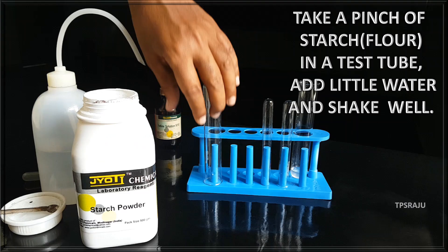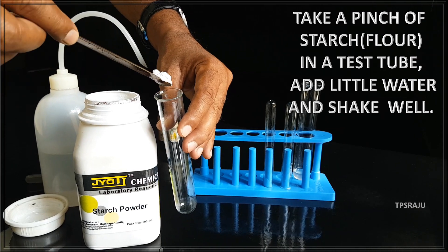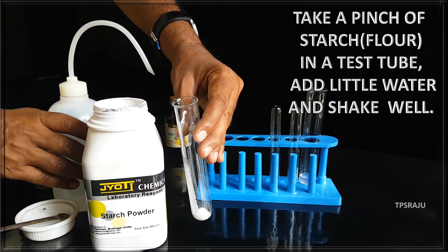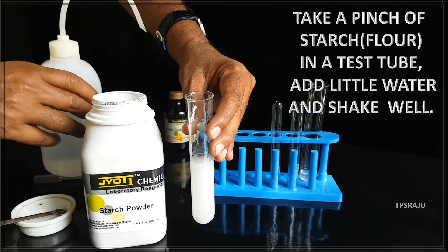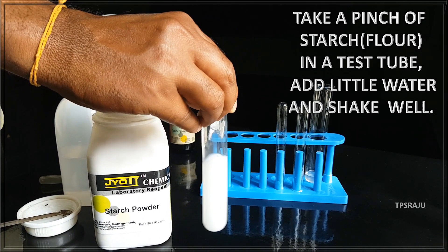First we have to prepare starch solution. For this, take a pinch of starch in a test tube, add a little water to it, and shake well. This is our starch solution.